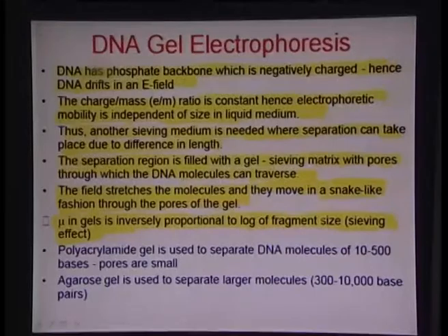There are also several gel materials which are used from time to time, various kinds of gels for this electrophoresis. Agarose is a very common gel material, and in about one or two slides I'll try to discuss some of the molecular structural aspects of the agarose molecule. Another very important, interesting, high resolution gel material is polyacrylamide.